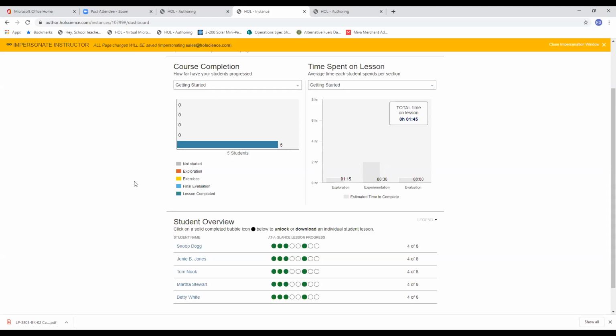So everything has really been pared down. The only things I can't pare down for your students are the dissection specimens. If you want your students to dissect a sheep brain, a sheep brain is a sheep brain. Same thing for a sheep heart or a fetal pig. Aside from the actual specimens for dissection, all other materials in your students' possession when they're conducting these experiments are significantly smaller by volume than what your on-campus students are using. So as long as the student proceeds as directed, there should be a minuscule chance of them harming themselves in any way.